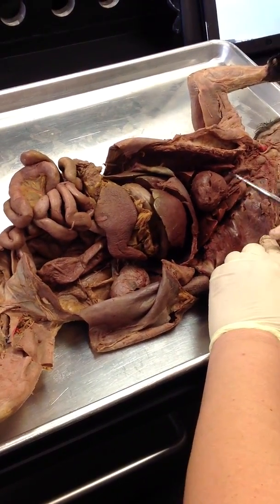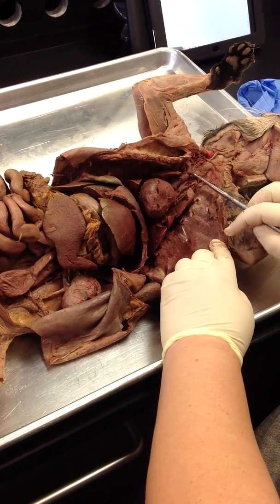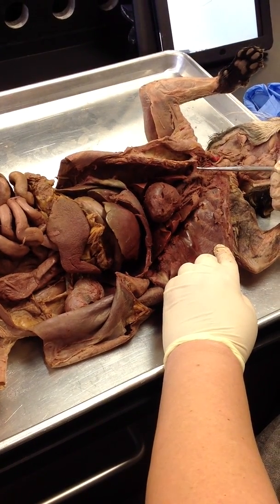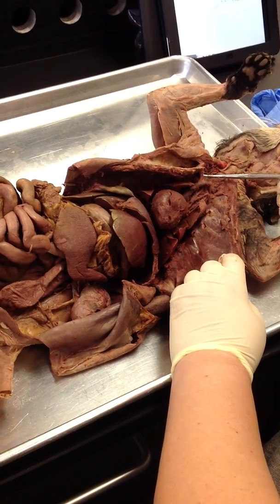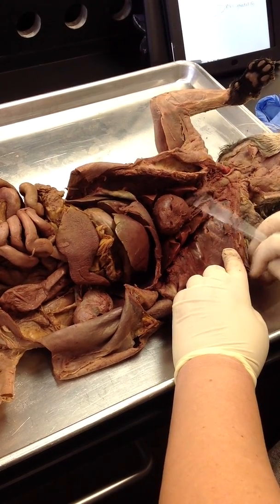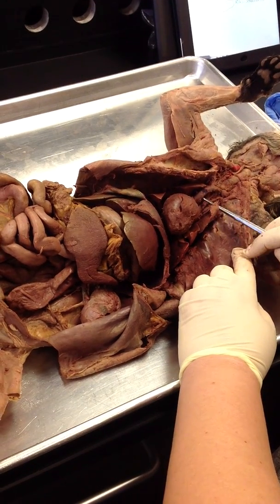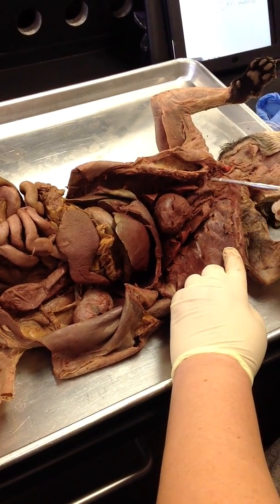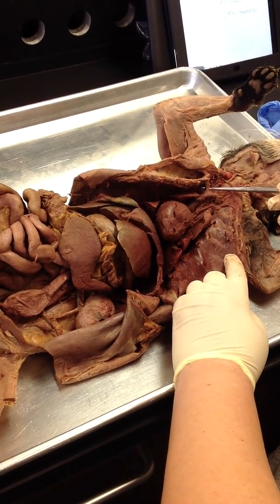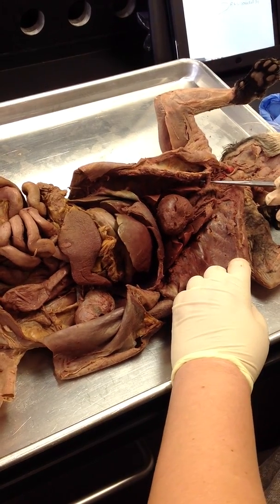So veins. So above the heart is the superior vena cava. We're going from the heart up. So if the heart is there, we're going up that way, yeah? Oh, that's the brachiocephalic. So this is the superior vena cava. So this is which brachiocephalic? The right. Right brachiocephalic vein. Right? You got to make sure you use whole names on the exam, yeah?